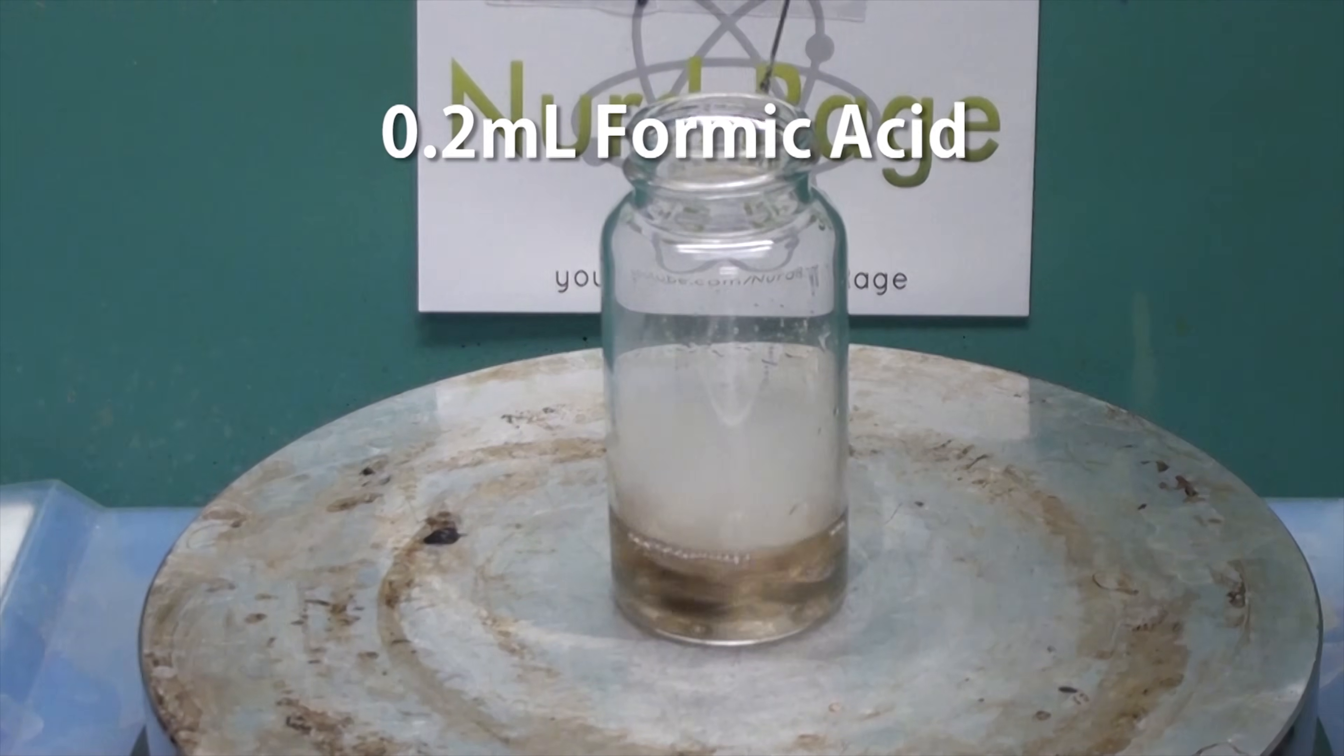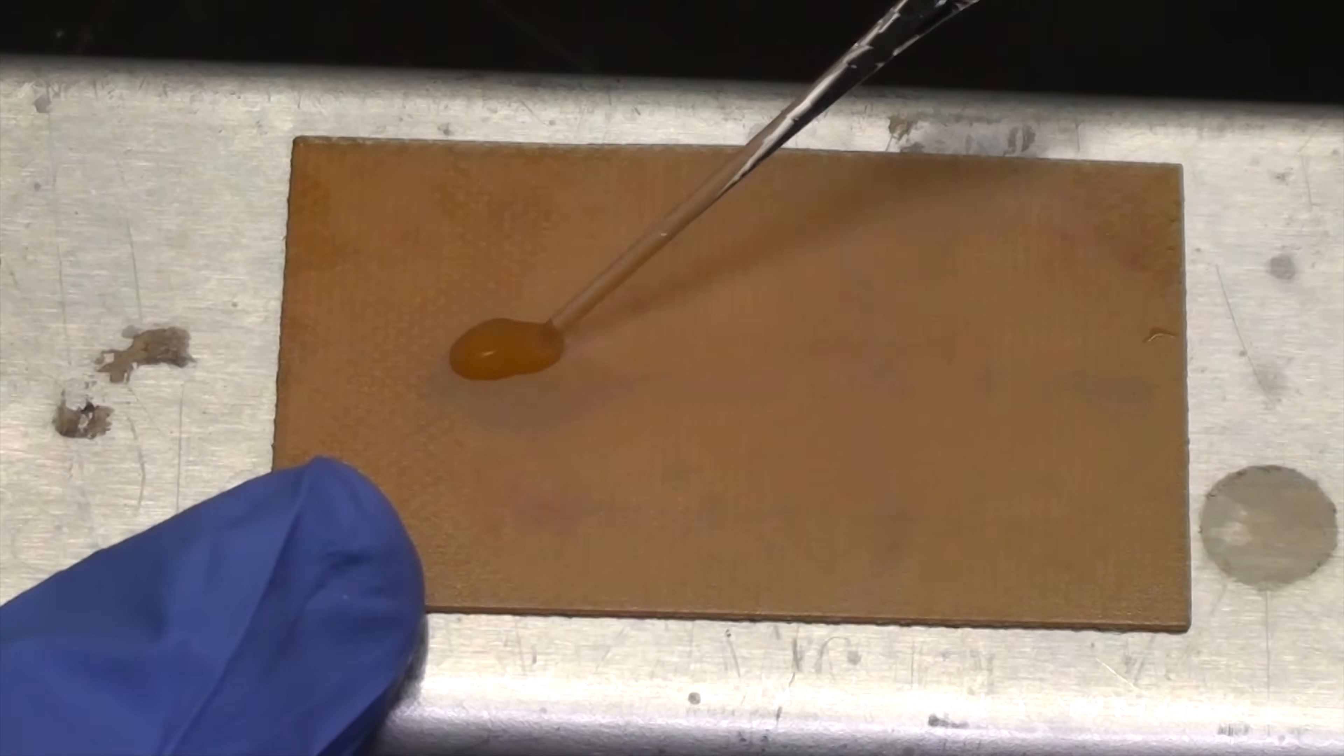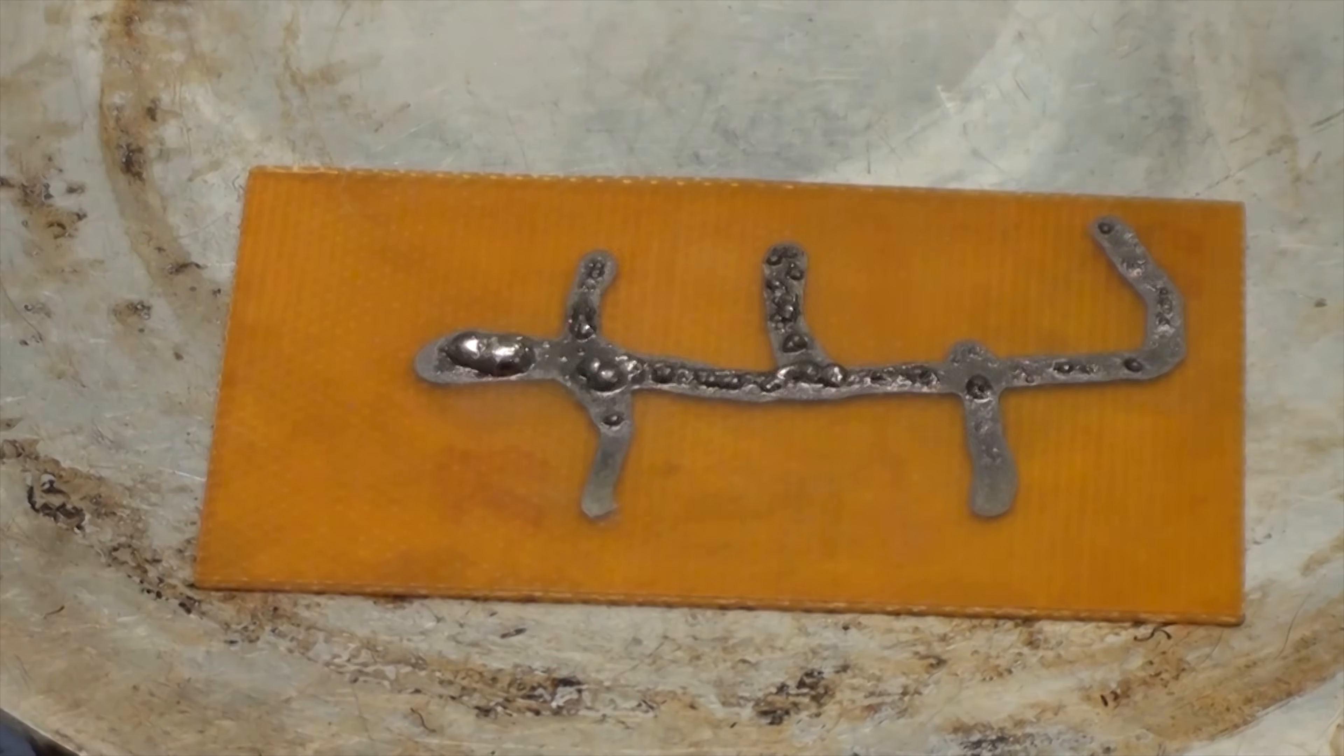Greetings fellow nerds. Some years ago I showed how to make silver conductive ink, and one of the key ingredients was formic acid.